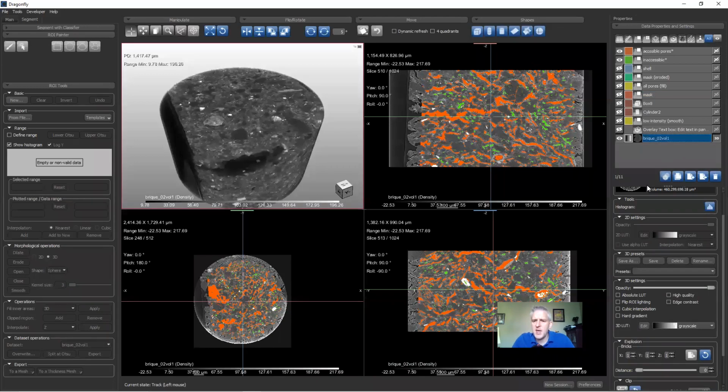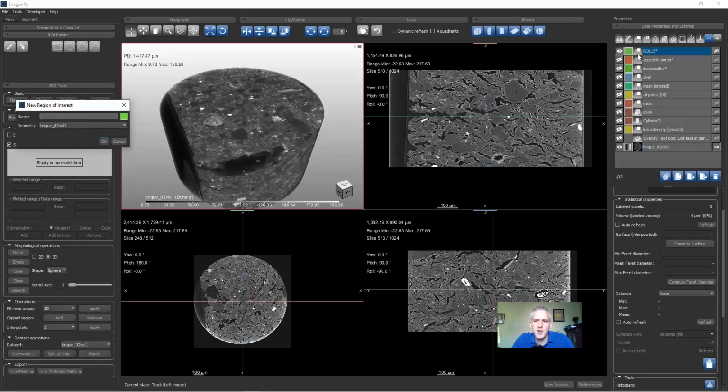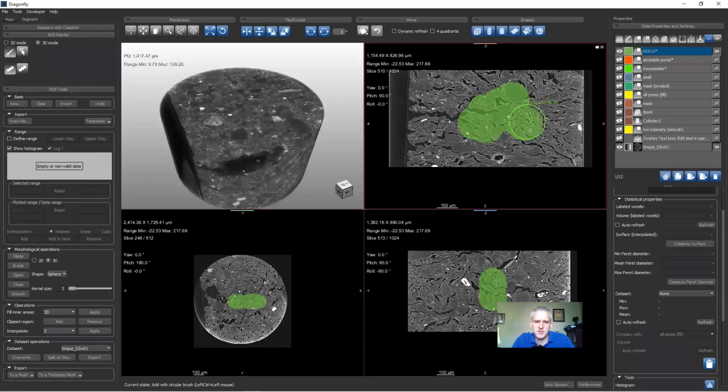I'm going to take this data set, and let's pretend like we've got some crazy shaped data. What I'm going to do here is contrive a small, funny shaped data set just by creating an ROI. So it's a bit complicated, but it's just to prove a point. I'm going to take this ROI, and I'm going to do 3D painting on it. And let's turn on 3D paintbrush. Looks good. Let's suppose I have this shape. Let's hope that's not too big to work with on my laptop. And what I'm going to do is take my image data and make a copy of this very quickly.